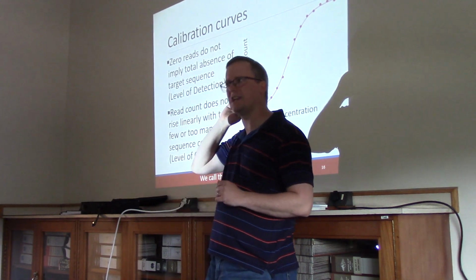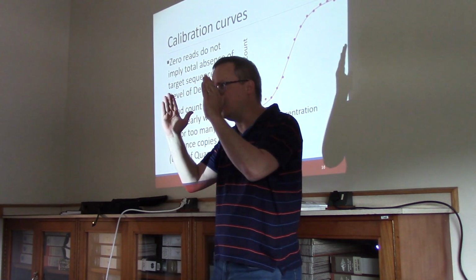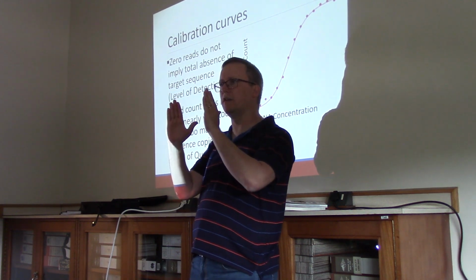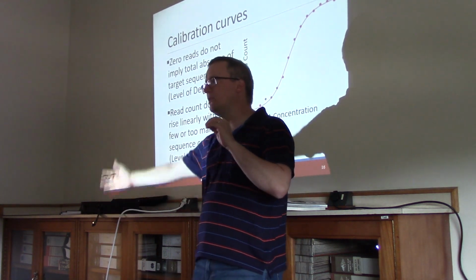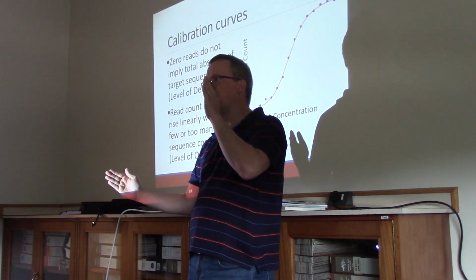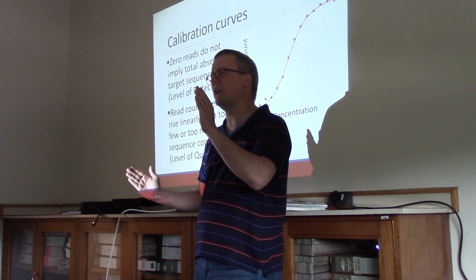Now, level of quantitation is usually to say that we have some range in which the variability of measurement is so low that we can accurately quantify this species. All right, so maybe if a bacterium is present at least 1% of the community, we can detect that. And if it's up to 30% of the community, we can measure that pretty well.